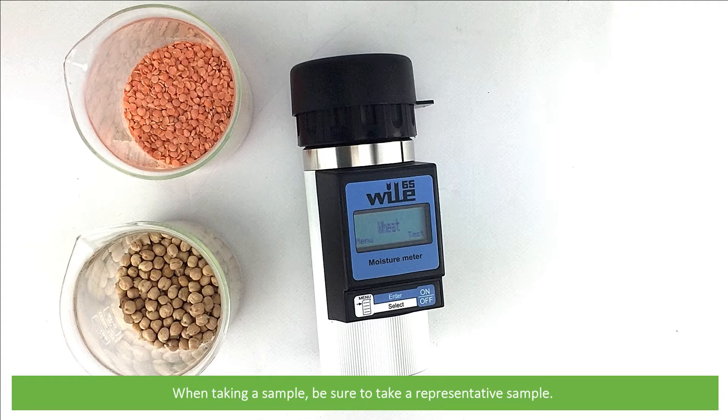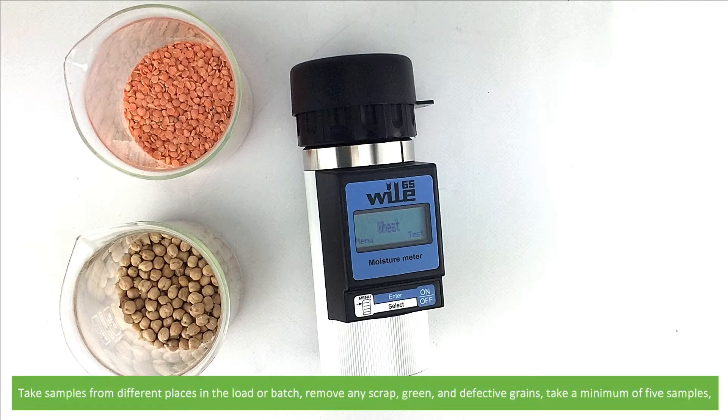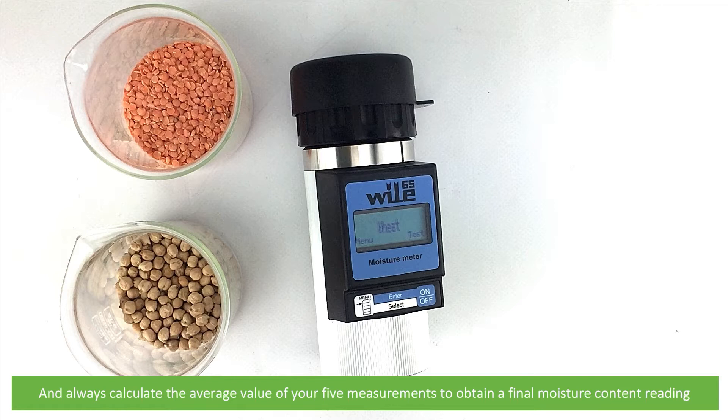When taking a sample, be sure to take a representative sample. Take samples from different places in the load or batch, remove any scrap, green or defective grains. Take a minimum of 5 samples and calculate the average value of your 5 measurements to obtain a final moisture content reading.